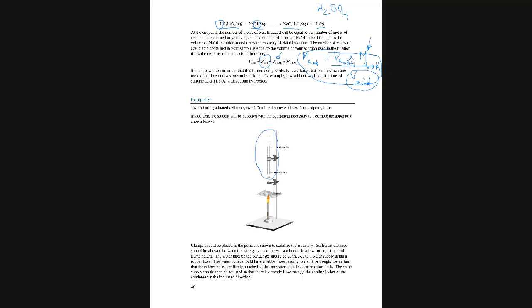And why do we need the condenser? Basically, the condenser captures the vapor. We have the reaction here, and it captures the vapors and returns them again to the liquid phase in the reaction mixture.